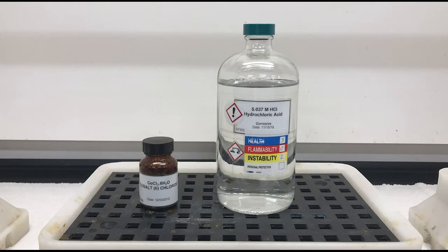To prepare our solution, we'll use cobalt-2 chloride hexahydrate and hydrochloric acid as our solvent. Be sure to write down the concentration of the hydrochloric acid as we're going to need it later in our calculation.